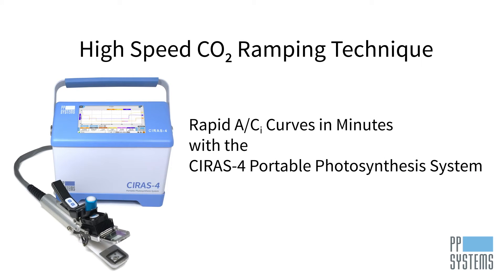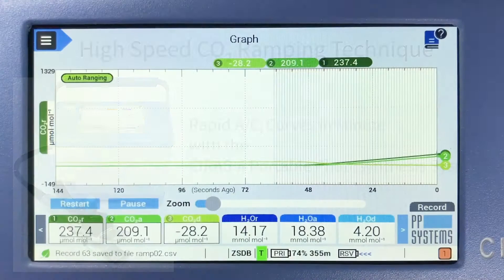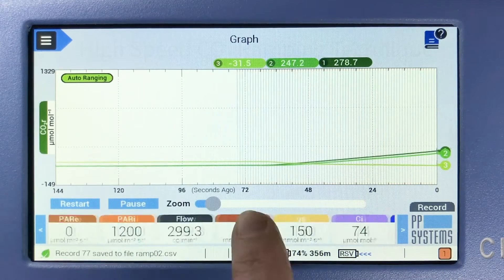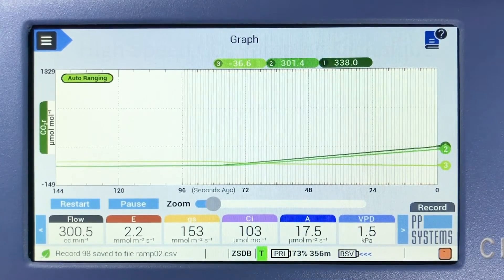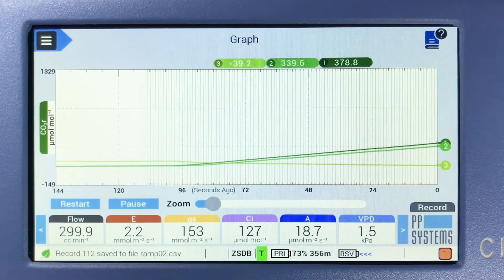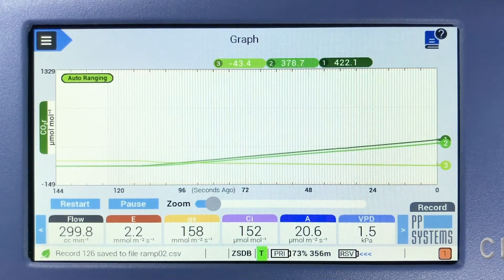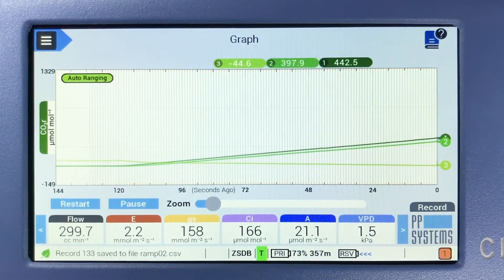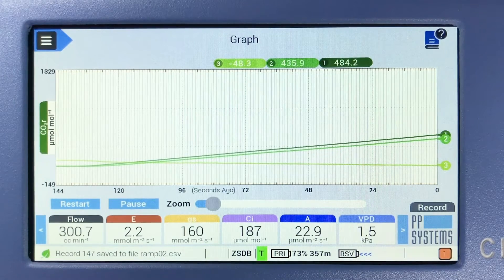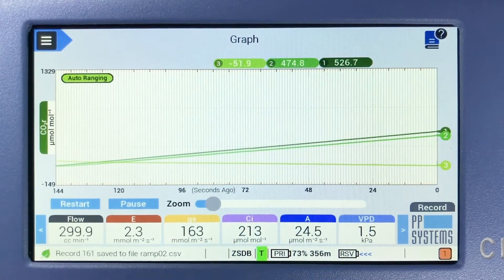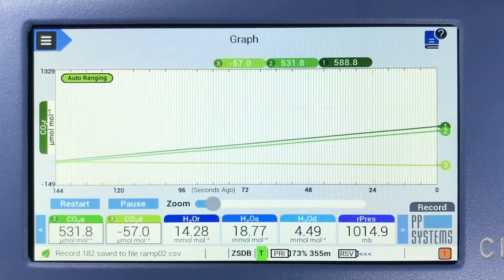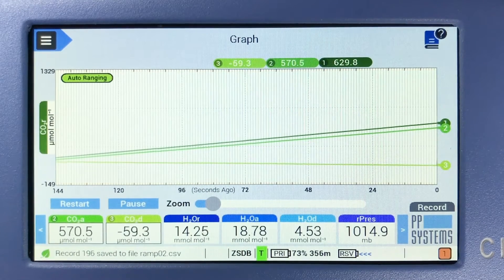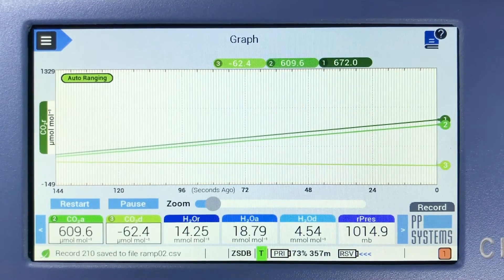The CIRIS-4 portable photosynthesis system can change CO2 gas concentration while simultaneously and continuously recording data. Linear ramps of CO2 concentration are easier to program and record than in previous instruments, and now that there's no longer a need to define a response script for a ramp test in the CIRIS-4, the process is faster and more streamlined than ever. Follow these simple steps to create ACI curves with the CIRIS-4 in minutes.